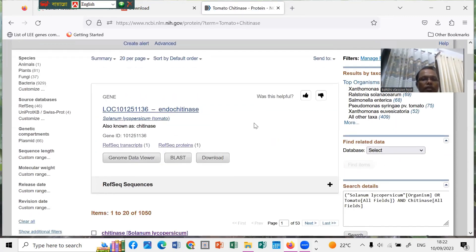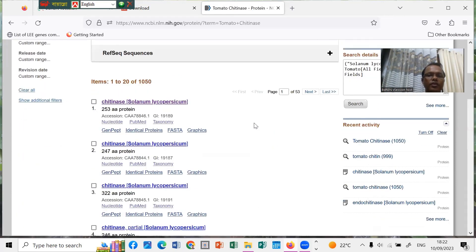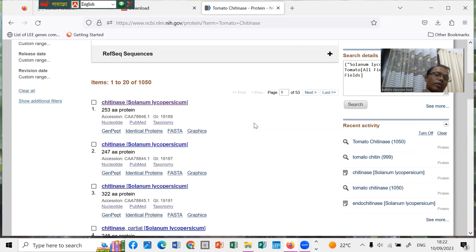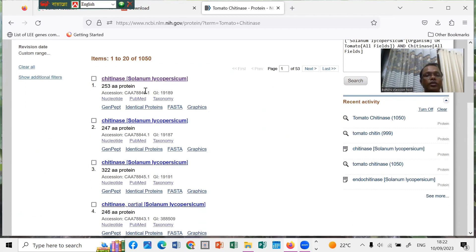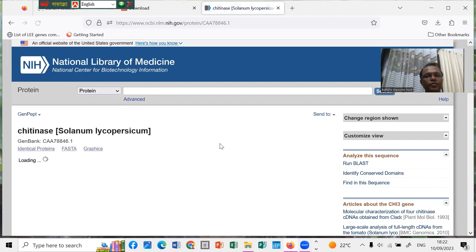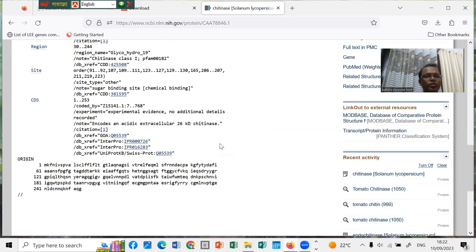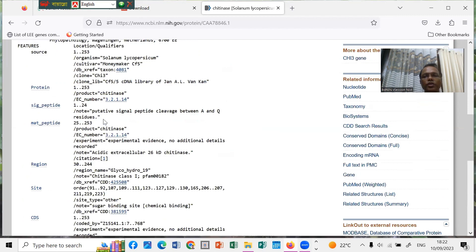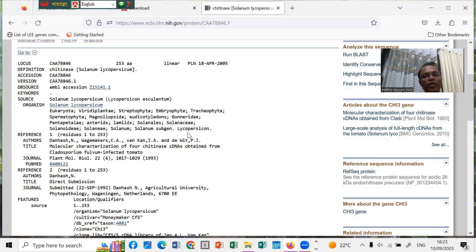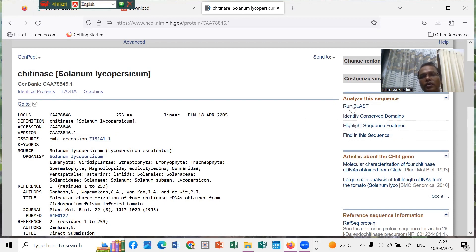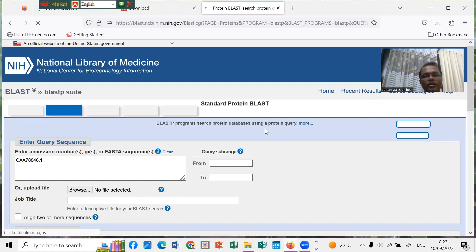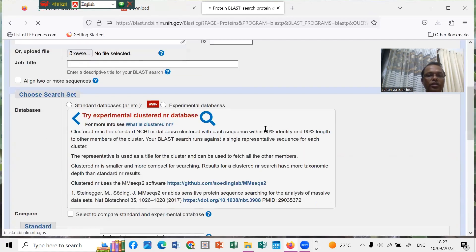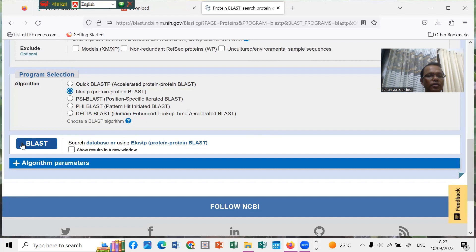You can see a lot, 1050 results. We can use this one, 253 amino acids, Solanum lycopersicum. Click it. You can see the coding sequence, this is the protein sequence. We want to use this sequence and find homologous sequences for the phylogenetic analysis. Now we can run the BLAST for getting the homologous protein.